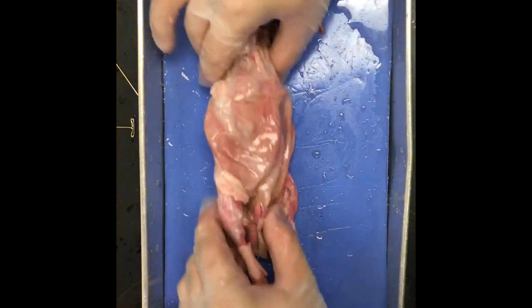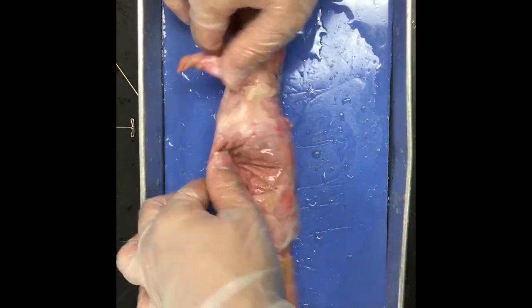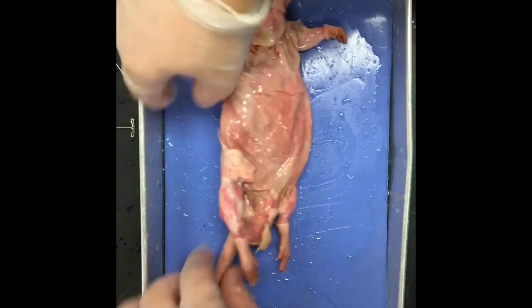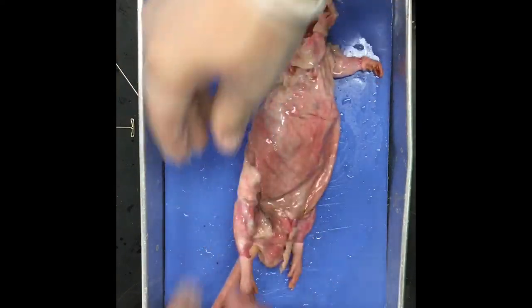All right, so all the skin has been removed. This is all muscle here that you're seeing. All this pink. You tell the sex of the rat right there. External testicles, so it's a boy.